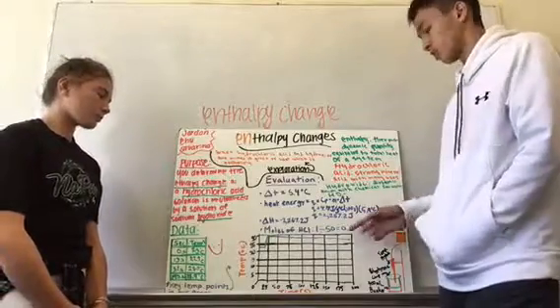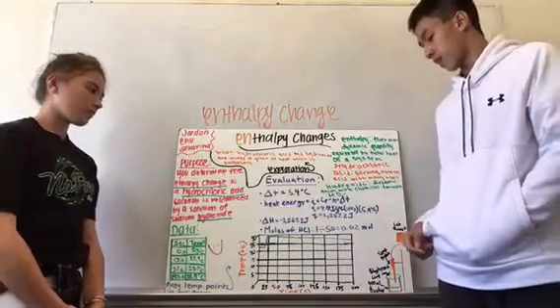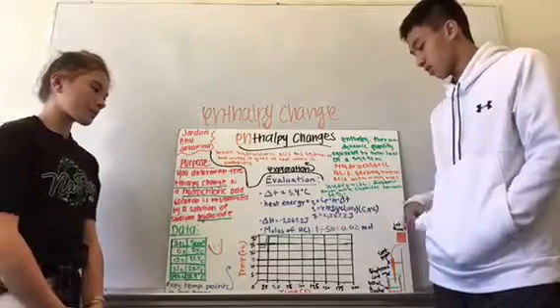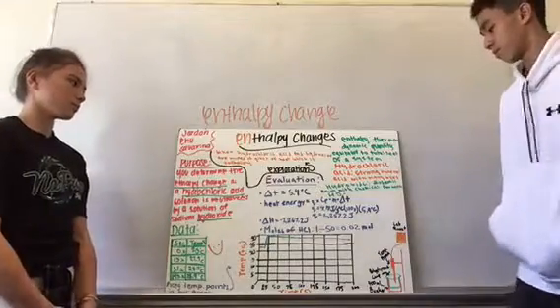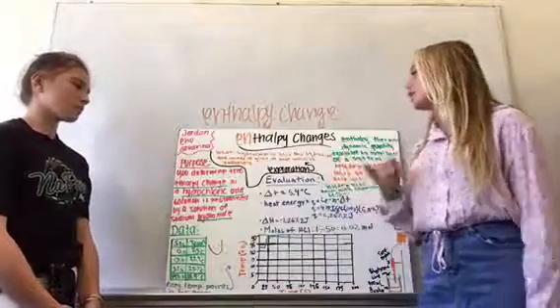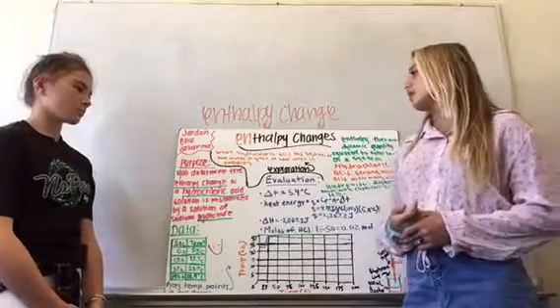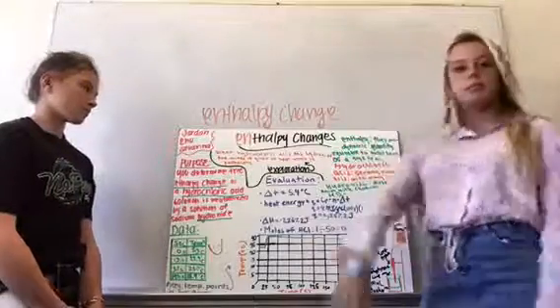And the moles of hydrochloric acid in this experiment was 0.02 moles. We found this by dividing 1 by 50, because there's 1 mole in 1 liter. Our conclusion was that when the hydrochloric acid and hydroxide are mixed, it gives off heat, which is enthalpy.